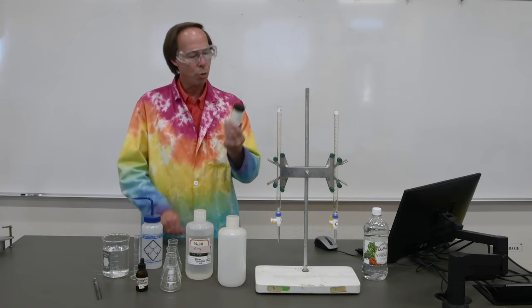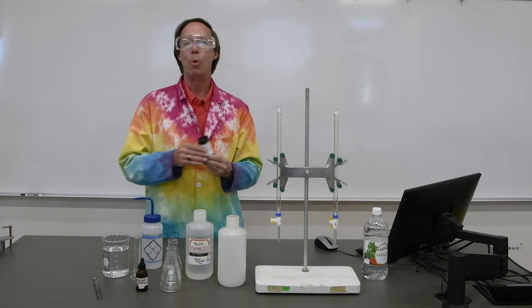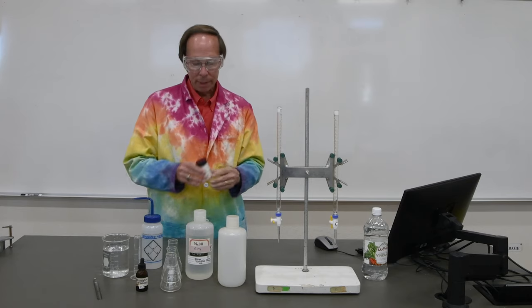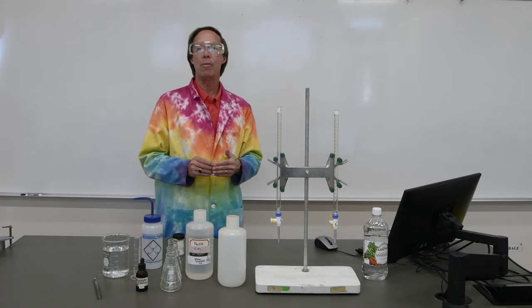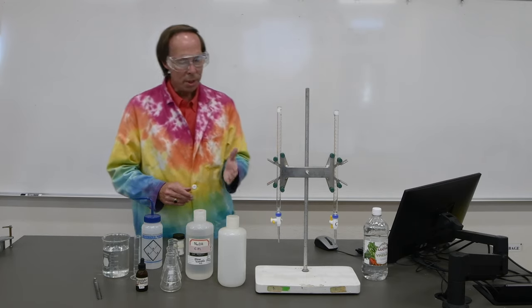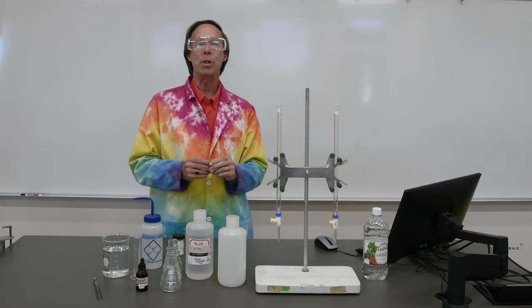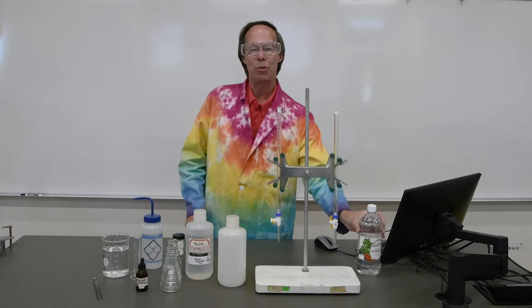Knowing the number of moles of KHP from its mass, we can figure out how many moles of sodium hydroxide there were, and now know more accurately what the concentration of our diluted sodium hydroxide solution is. We can then use that now standardized sodium hydroxide and titrate a sample of our vinegar solution.